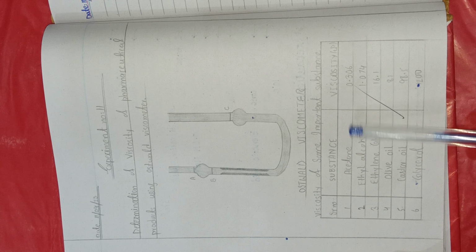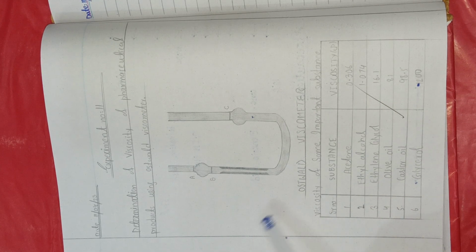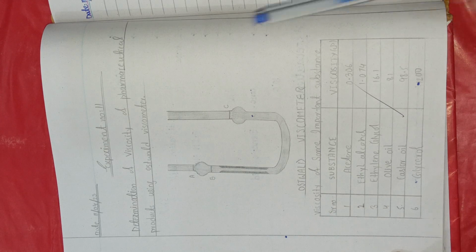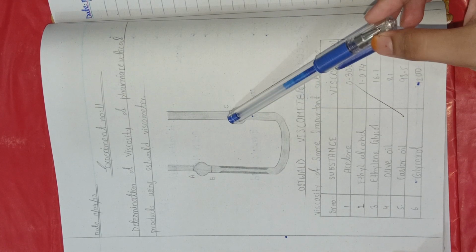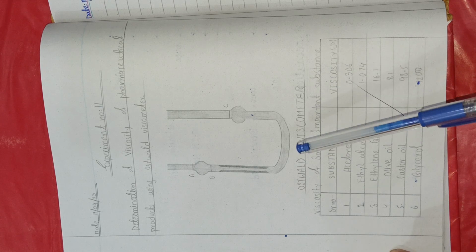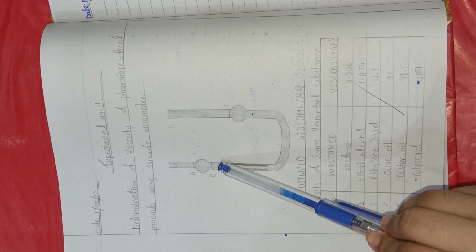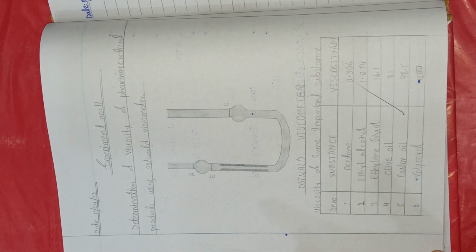So this is the pencil work of our experiment, and this is the diagram of the Ostwald Viscometer, and I have explained to you that it has three markings, A, B and C. So first you are going to put water from this arm, and you are going to fill it up to the mark C. Then you will find out the volume and weight of that water, and at the last after measuring, you will have to take water above the mark A. When it reaches above the mark A, slowly it will come down.